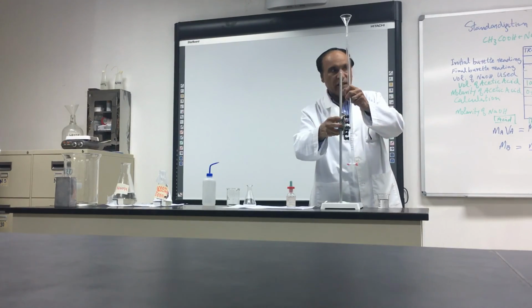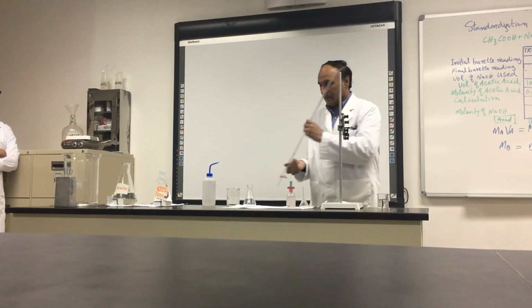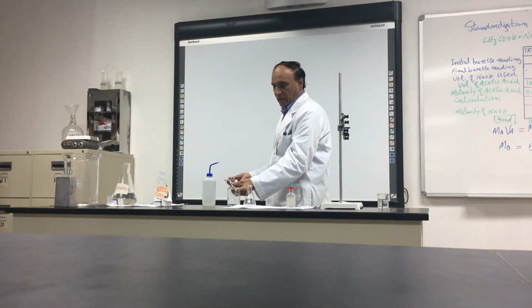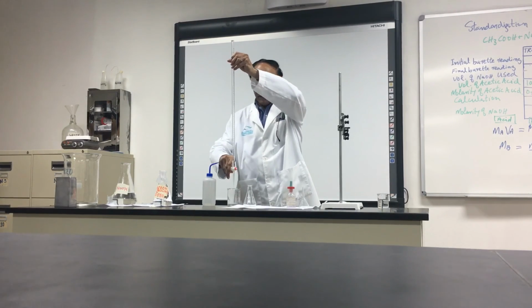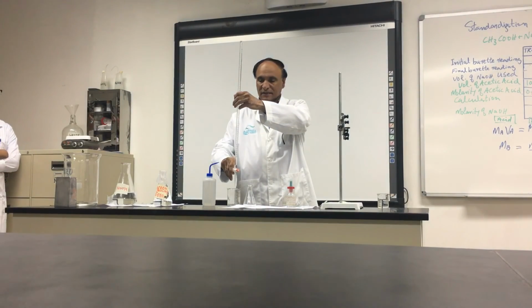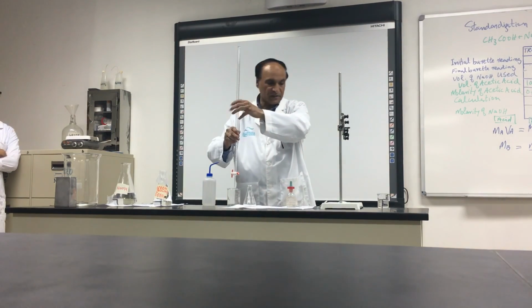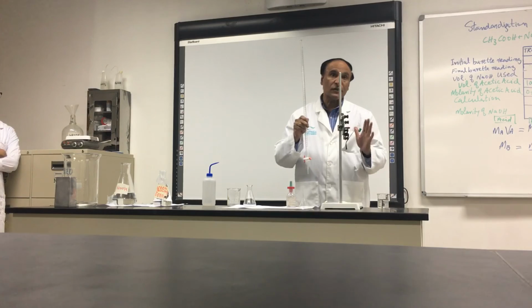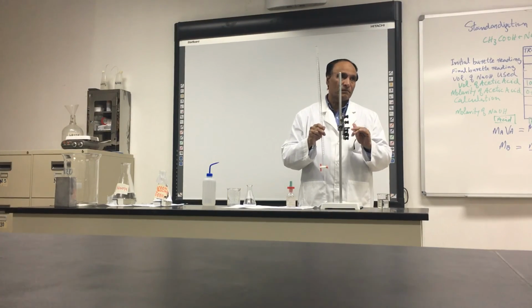And take it, move it, throw it from here. So it is washed with the sodium hydroxide, the same sodium hydroxide which was here in a small beaker. All this one student is doing. The other student will do another thing. I will tell you what he will do.